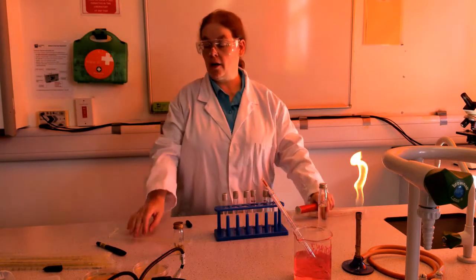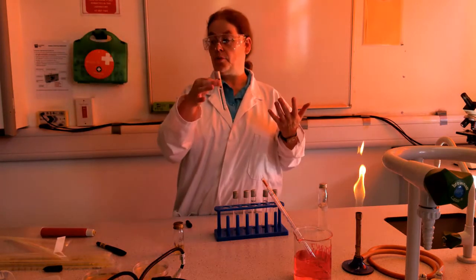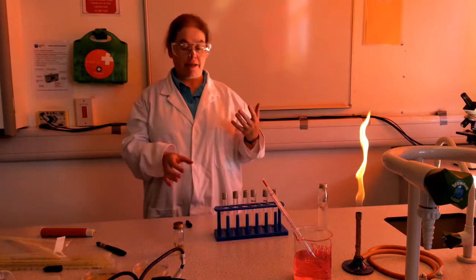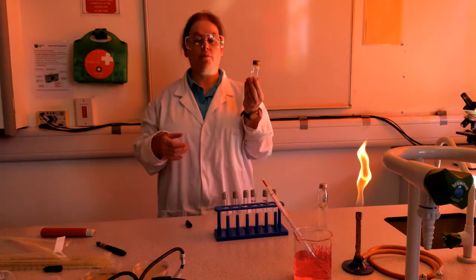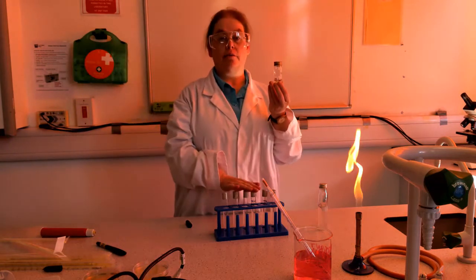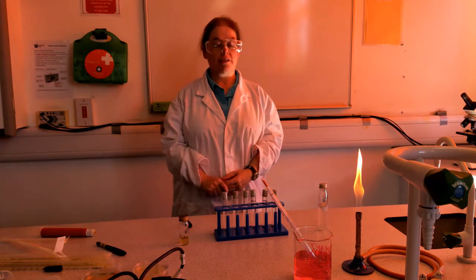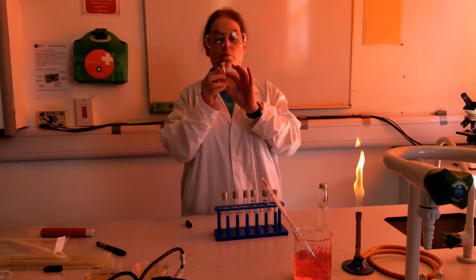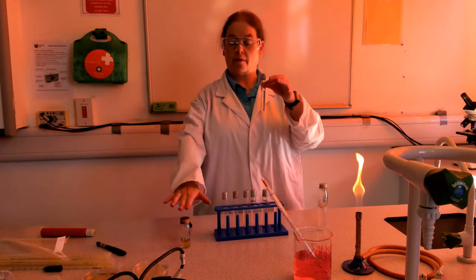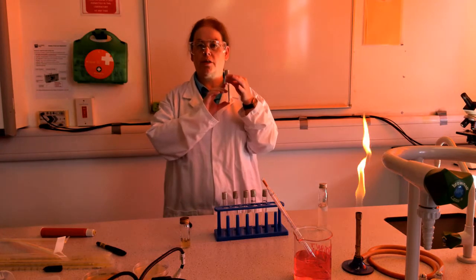Right, so what I've got now is a whole row of test tubes. Each has 9.9 millilitres of water. For each bacterial culture that you want to count the number of bacteria, you need 3 test tubes. And what I'm going to do is as follows. I'm going to transfer 0.1 millilitres of the bacterial culture that I want to count into the 9.9 millilitres of water.